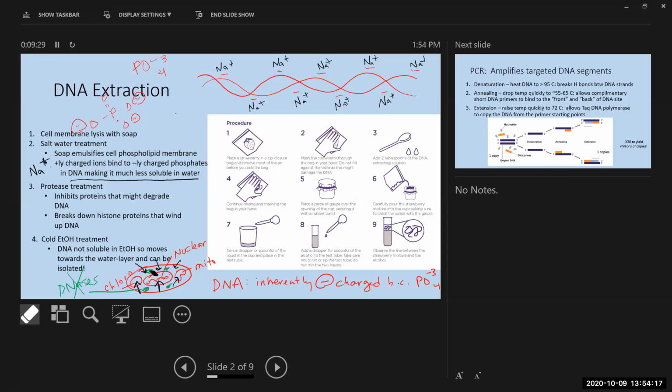And so this is what you do if you work in a lab, to a very small extent, right? You have these little tubes that we do it in if we have just a small amount of DNA to start off with. But it's really, really fun. All right, so there you go. Hopefully you try it. All right, so what we're going to do now is do this virtually.